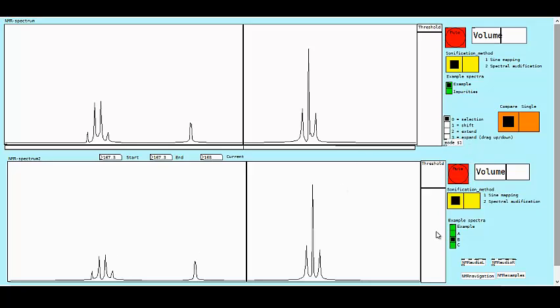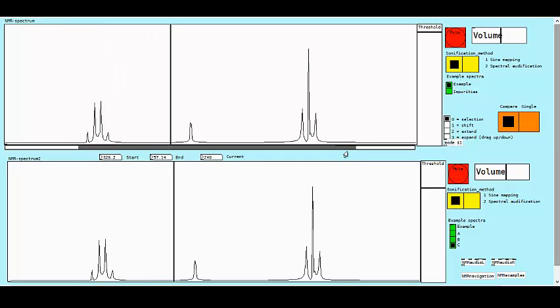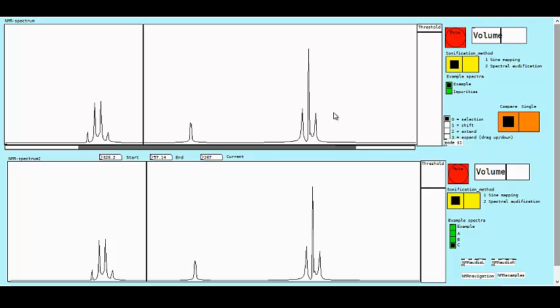We listen to B. We can hear there that these peaks are slightly different pitches because these two are actually half the size. If we switch to C, we can see that it is in fact exactly the same. So there we go. That's how we use this for comparison.